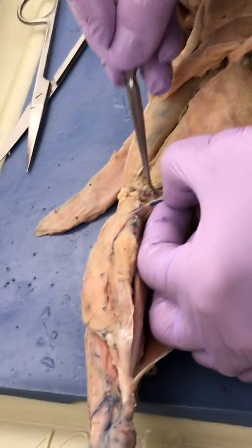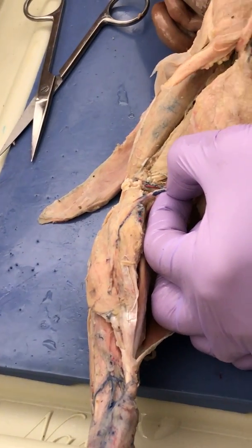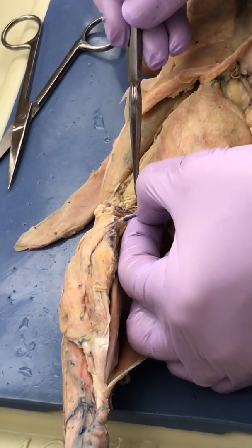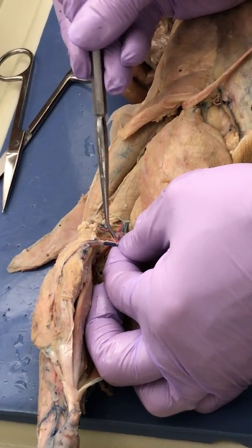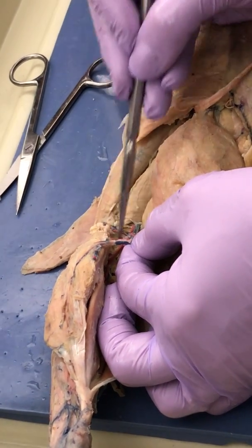What did you say that nerve was? Sciatic. Okay, the reason I'm just digging here is, see, your popliteal comes out really nice, vein and artery. And then your anterior tibial is the one that's going down. And then I'm holding the posterior tibial, just picking some of the fat off of it.